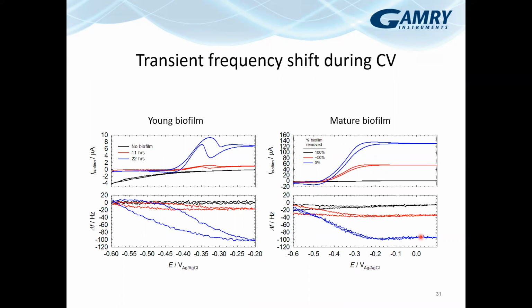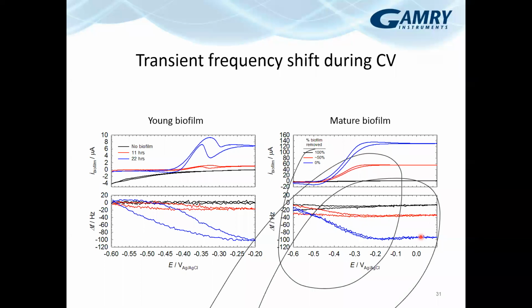Oh, okay. Yeah, so now that depends on how the two phases partition out and whether they partition out on the surface of the electrode. I think that has a lot to do with maybe hydrophobic and hydrophilic interactions. And you might choose a particular type of quartz crystal where you know that the ionic liquid will tend to adhere. Otherwise, I'm not sure even if you mixed ionic liquid and water in an aqueous environment, whether it would actually stick to the crystal.